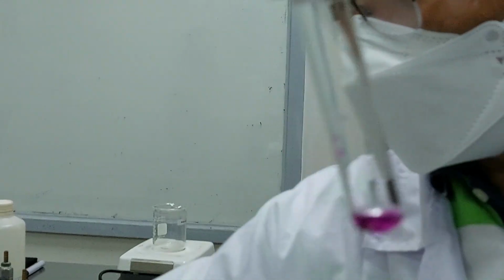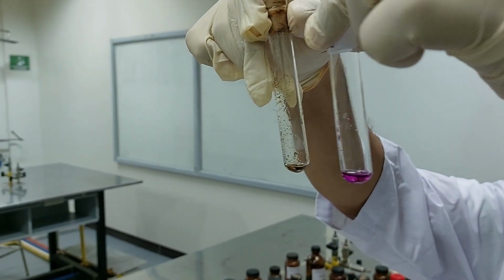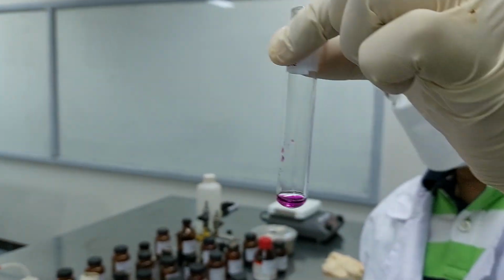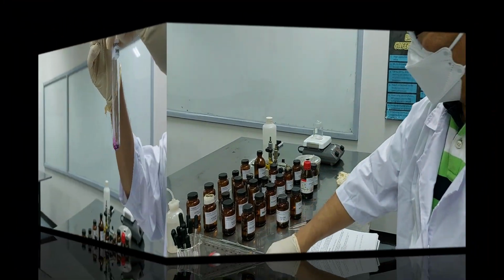Compare that with the result for acetylene. See the difference, okay? So the violet is still there. That means potassium permanganate cannot oxidize hexane. Okay. So now let's go to aromatic benzene.